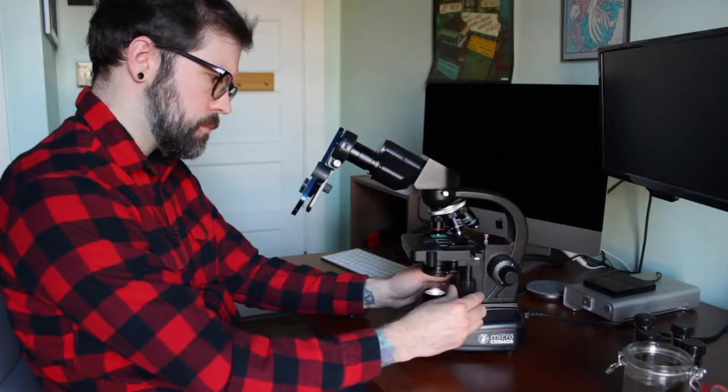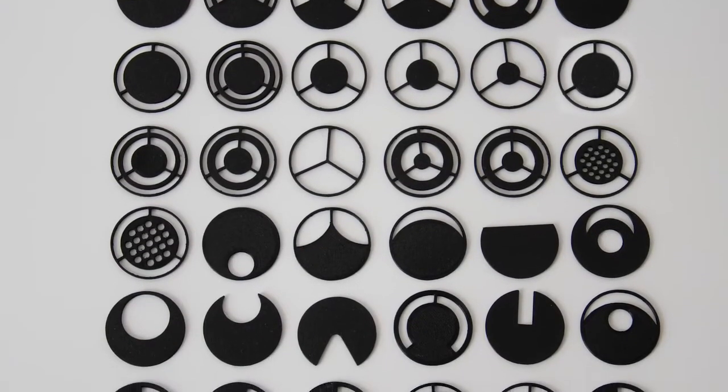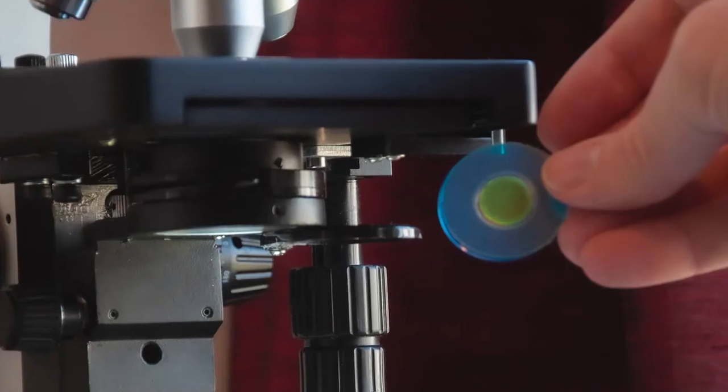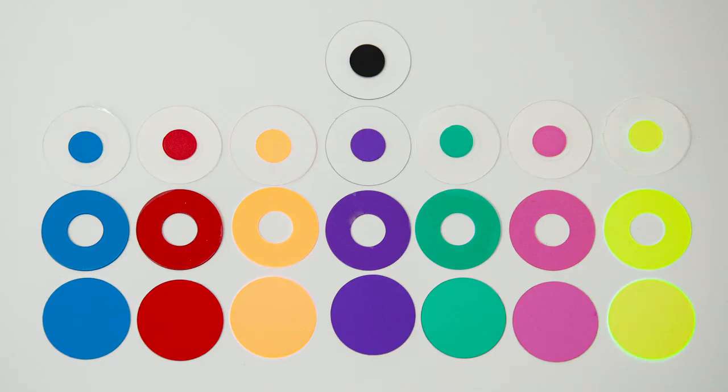The first of these options is a set of oblique illumination and dark field filters. Oblique illumination can add a sense of depth to your image, while dark field microscopy highlights samples on a dark background rather than a light background. And there's also an option for a set of Rheinberg filters. These can make your images more dramatic by adding color or color gradients.